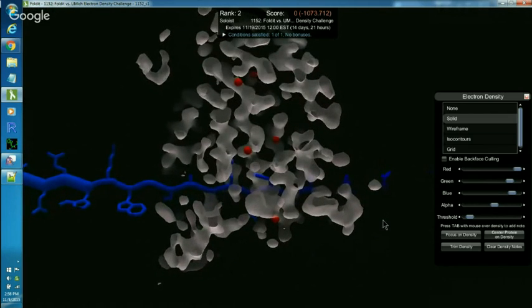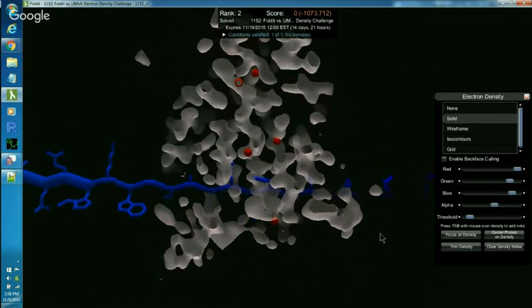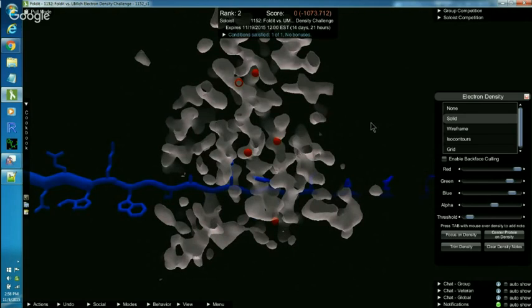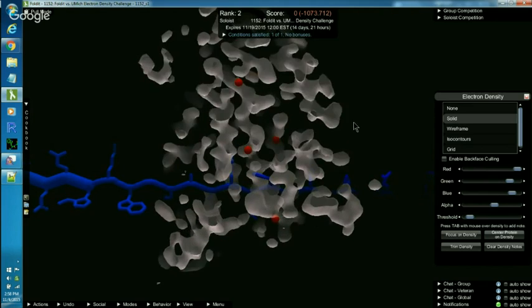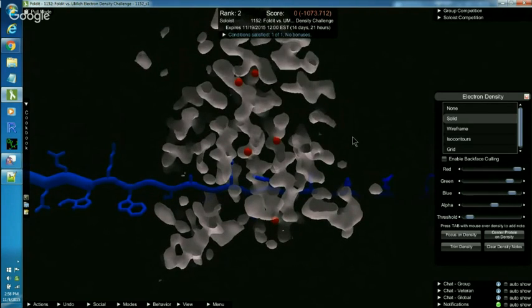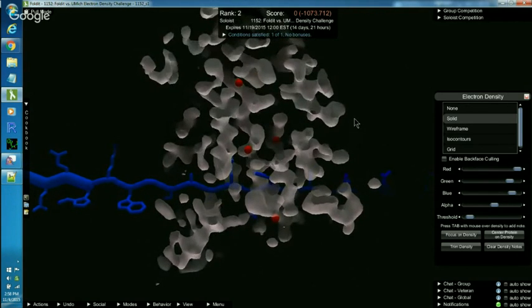You can see I'm rolling things in and out of view. Remember, we've cut away a lot of background and foreground. So, there's just a narrow slice through the cloud that we're looking at. And we have to roll things in and out of view.